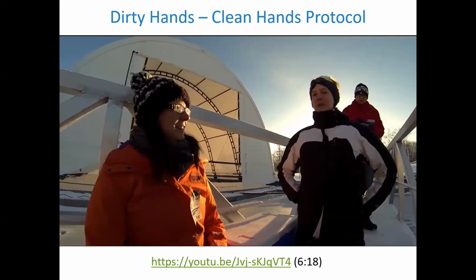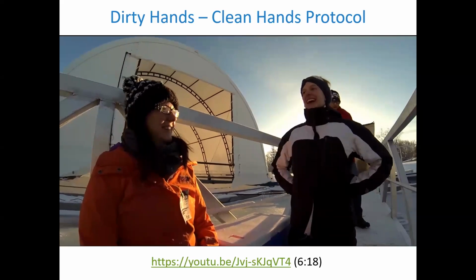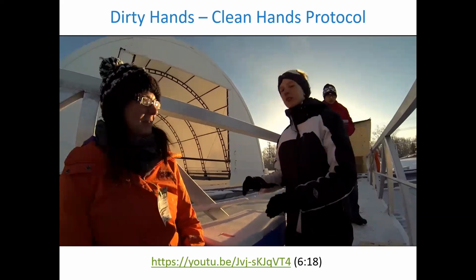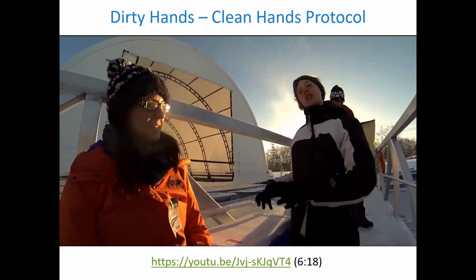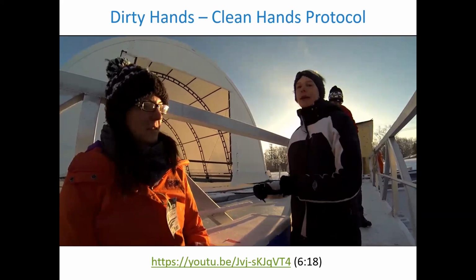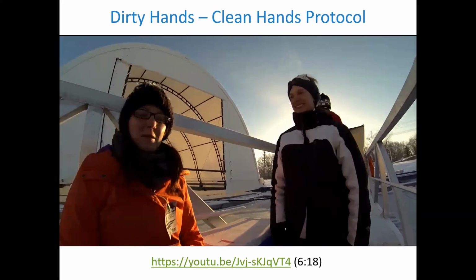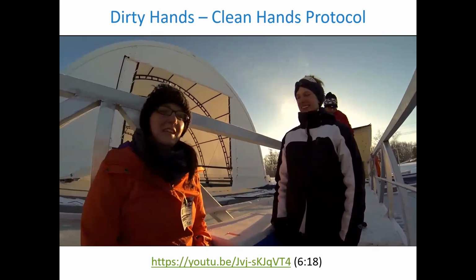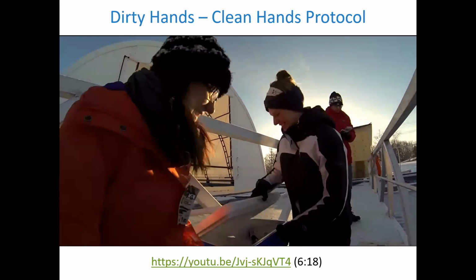All right, so I'm going to be taking on the role of dirty hands today. Haha. That means that my job is to physically reach into the cooler, put gloves on myself, gloves on Amanda, and then touch all of the different sampling bags. Except, as clean hands, my job will be to touch the sample and the falcon tube, which is inside the bag, which you'll see in a second. Shall we begin, Sarah? Yes, Amanda, let us. All right.